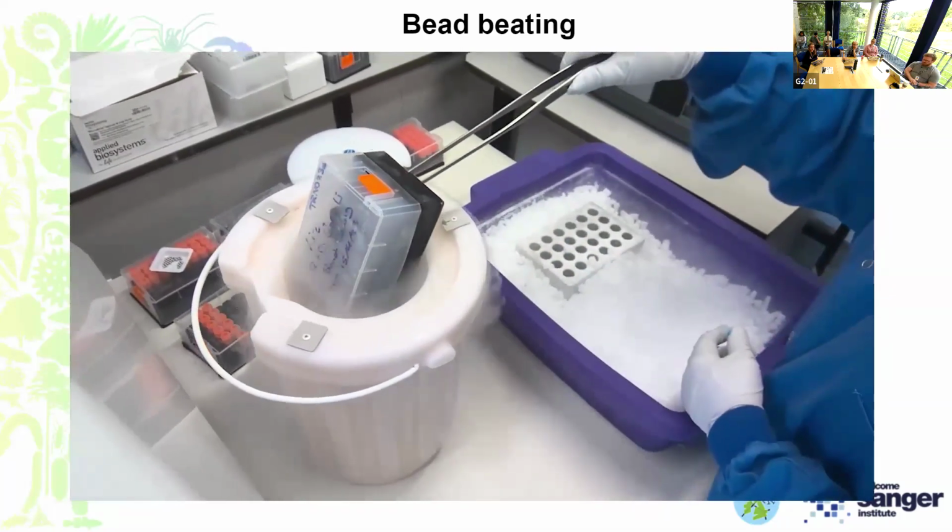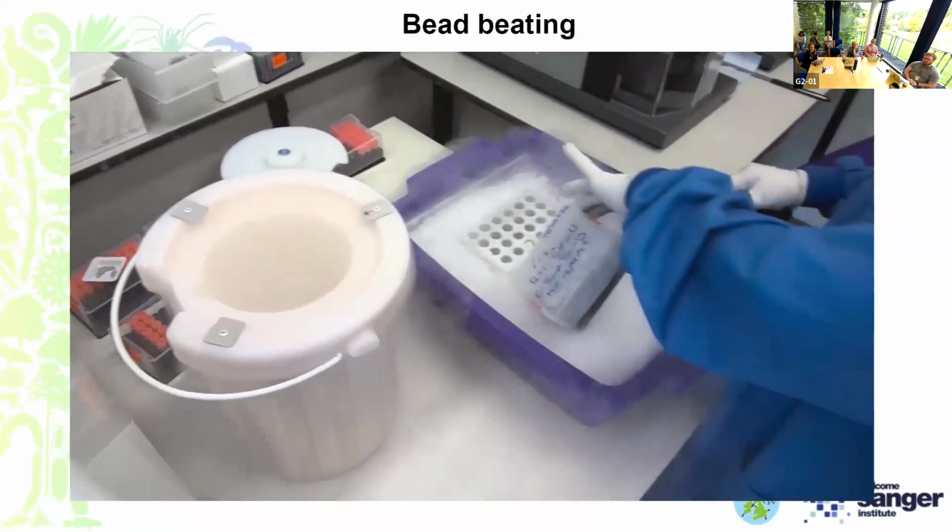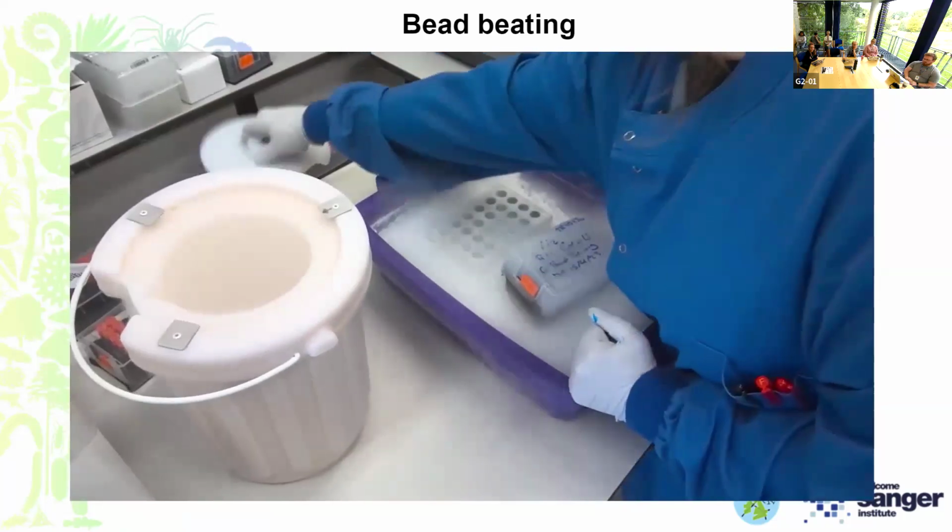Underneath my gloves, I have special liners, and I've also got eye protection, because I'm handling liquid nitrogen during this stage.